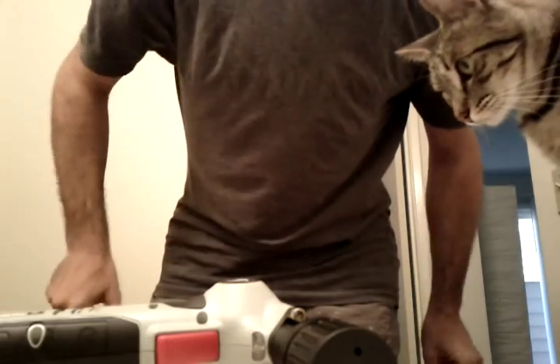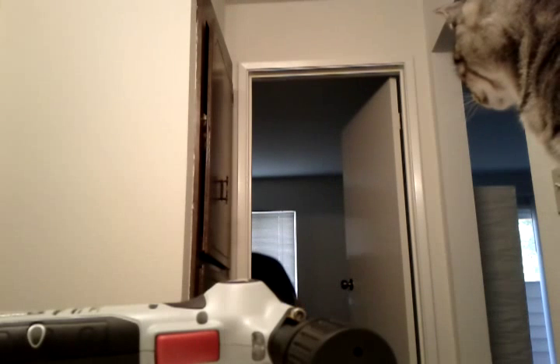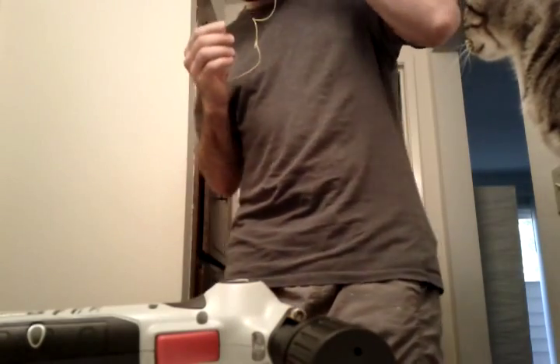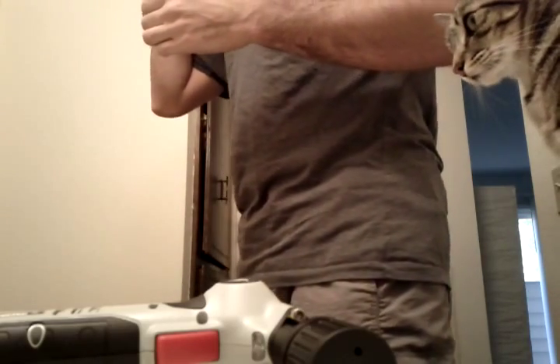Now, they recommend you use earplugs, and they're really not kidding, so I'll put in my earplugs. Alright. So, they recommend a minimum of, you're not going to like this cut, a minimum of 30 seconds in the vertical position. So, here we go.